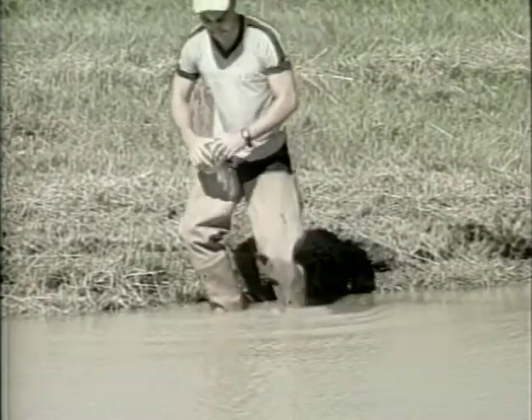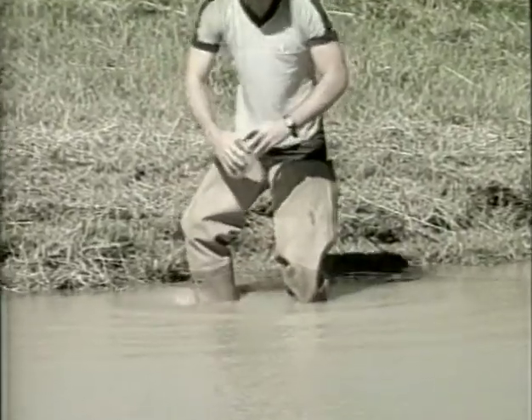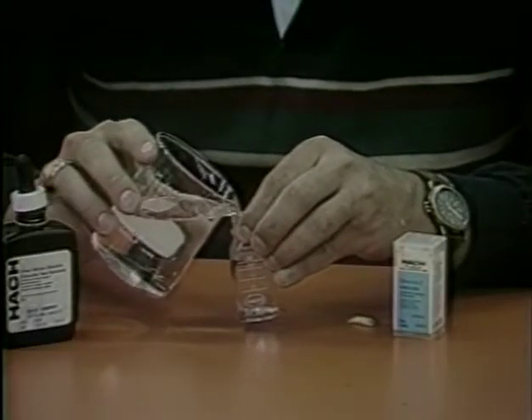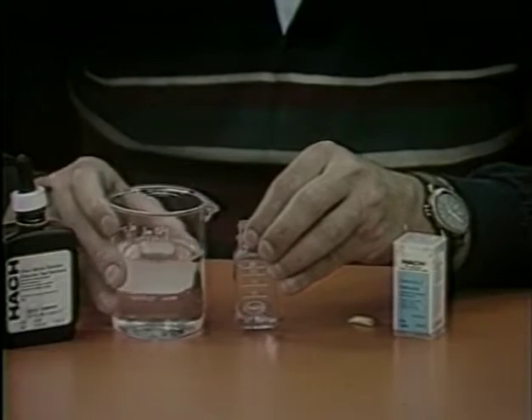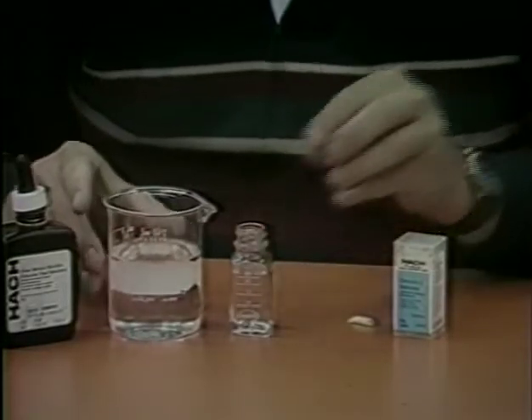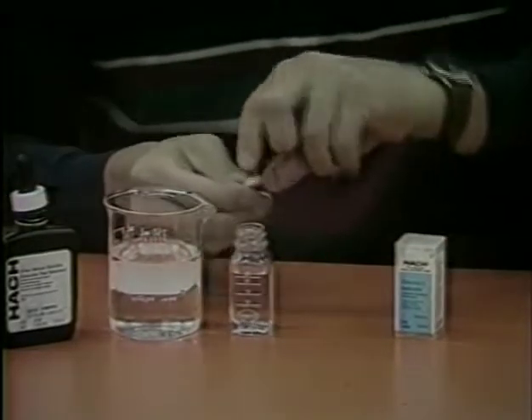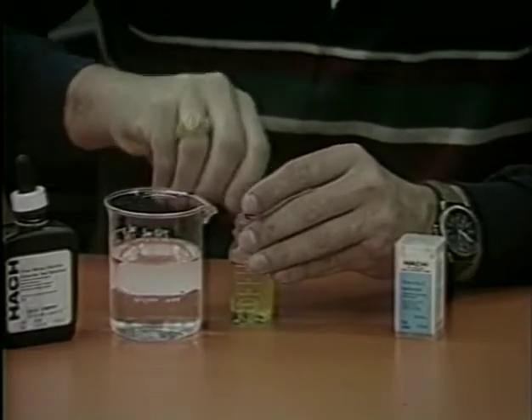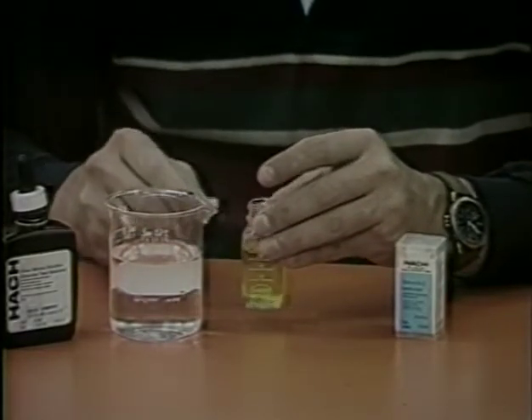Collect a water sample in a clean jar or bottle away from the pond bank. Fill the mixing bottle to the 23 ml mark as shown with this water sample. Add 1 chloride indicator powder pillow to the mixing bottle and swirl to mix. An orange color will develop initially, then a yellow color will be present.